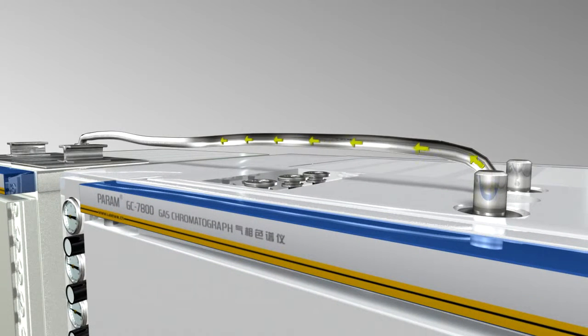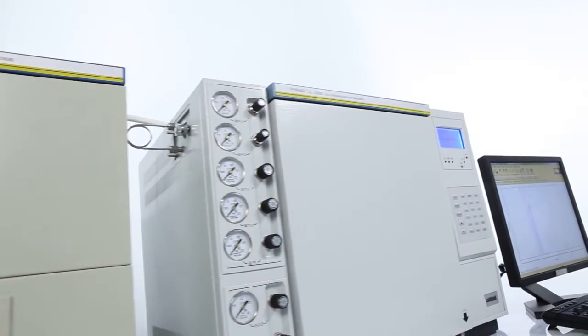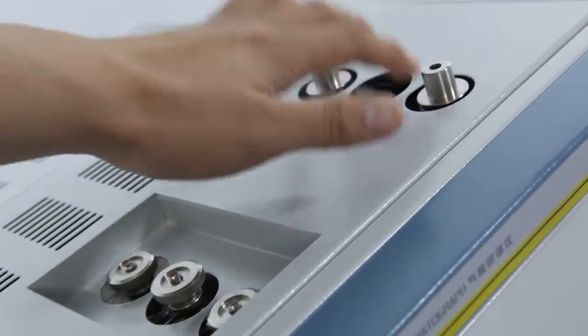The air backflush function can effectively prevent the sample from being cross-contaminated during the quick change of sample, and therefore improves the testing accuracy and repeatability.